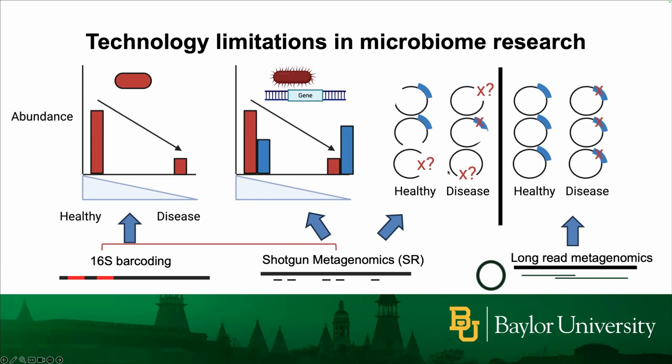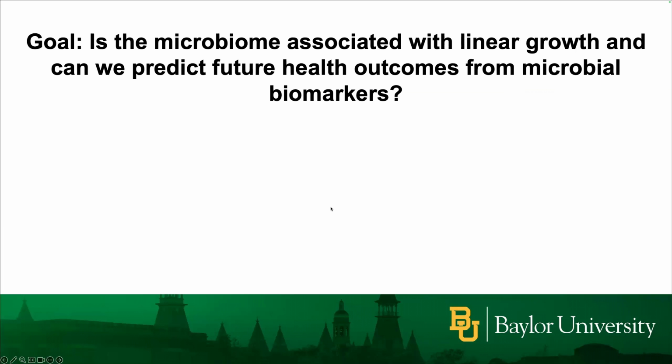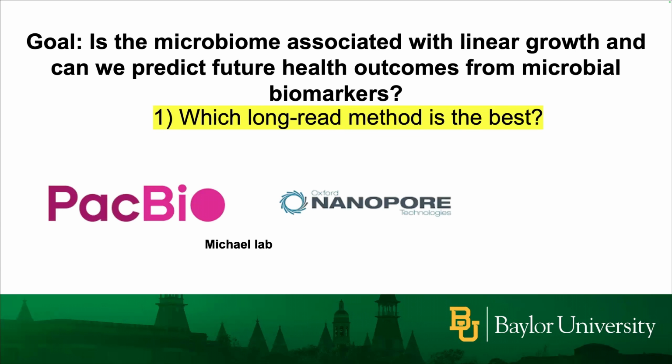So long reads provide this really unique opportunity where we may be able to get complete genomes, which then could allow us to do comparative genomics and pangenome analyses in the context, in this case, of childhood undernutrition. So we wanted to apply this to a data set, but first we really needed to understand which sort of methodologies would be the best in terms of generating high quality and high numbers of complete metagenome-assembled genomes, or CMAGs, which I'll refer to.